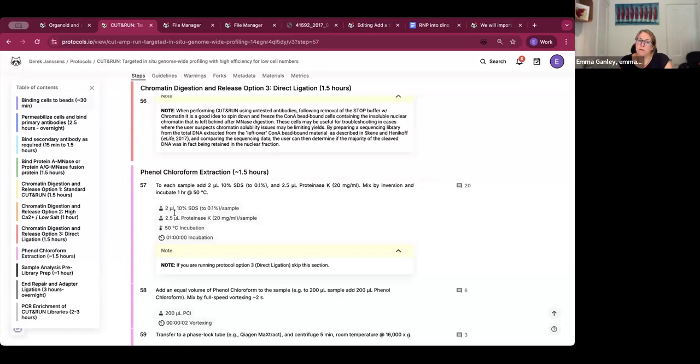You can use these components to add a timer, temperatures, quantities, and if you add this kind of information, then it can be run when you run the protocol, or you can scale amounts when you run a protocol. So if you're making a buffer or a master mix, you have all the amounts, and one day you want to make more just to create stocks or something, you can scale up or scale down the protocol automatically.